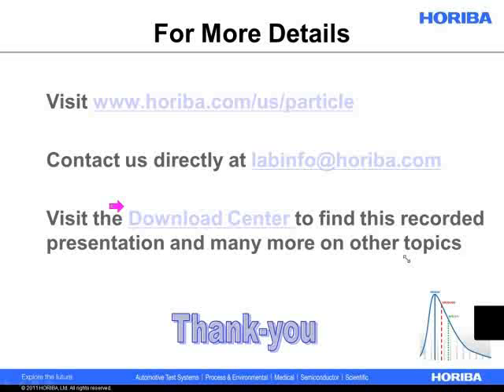It's neat because it gives you an idea of what the width of the needle is with a high degree of accuracy, because again, chances are the width, as you look at the head-on projection, is much closer to being a circle or a sphere than the length projections are. And so that's much higher accuracy than the much wider, larger distribution, which is all the different length projections sort of combined together.